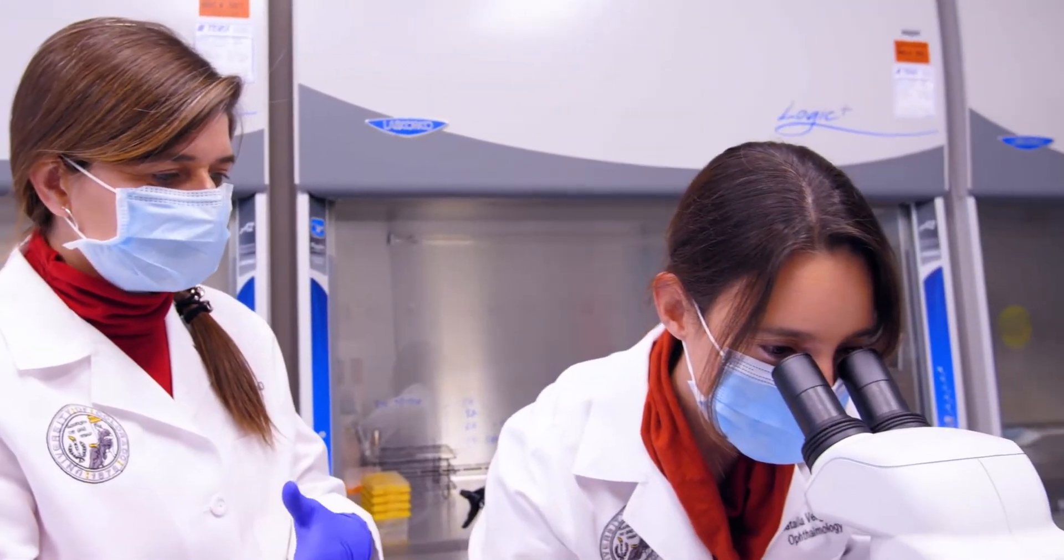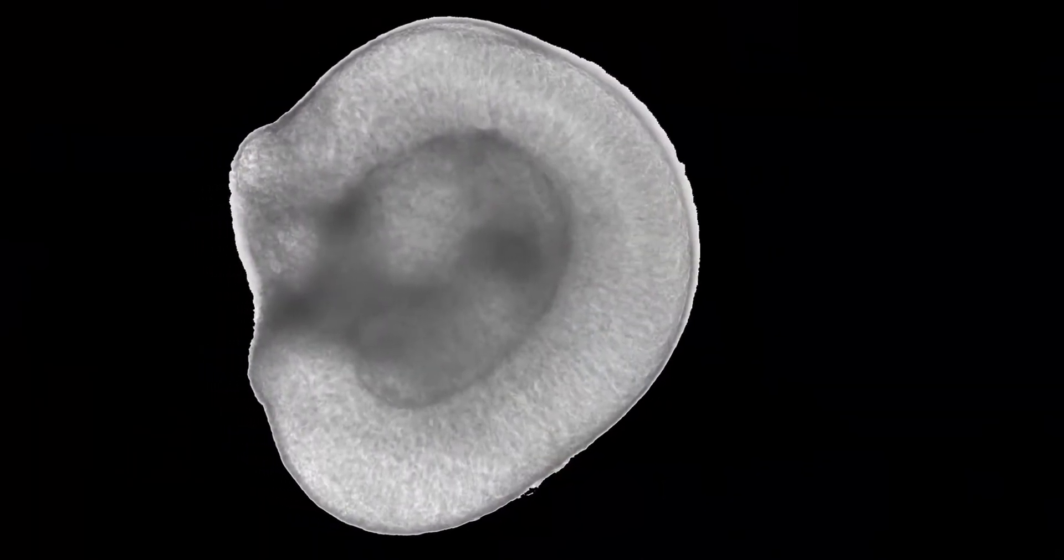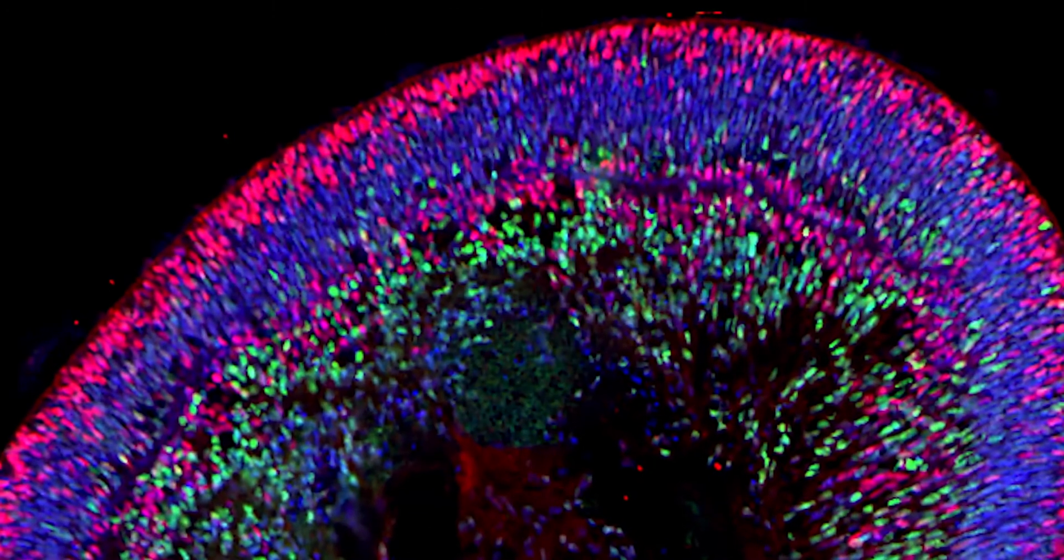Current stem cell technologies allow us to generate these three-dimensional mini-retinas in vitro from anyone, from individual people.